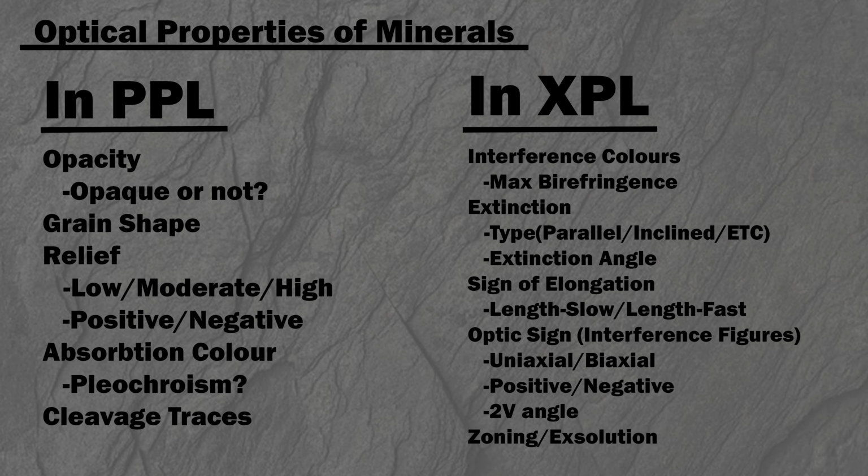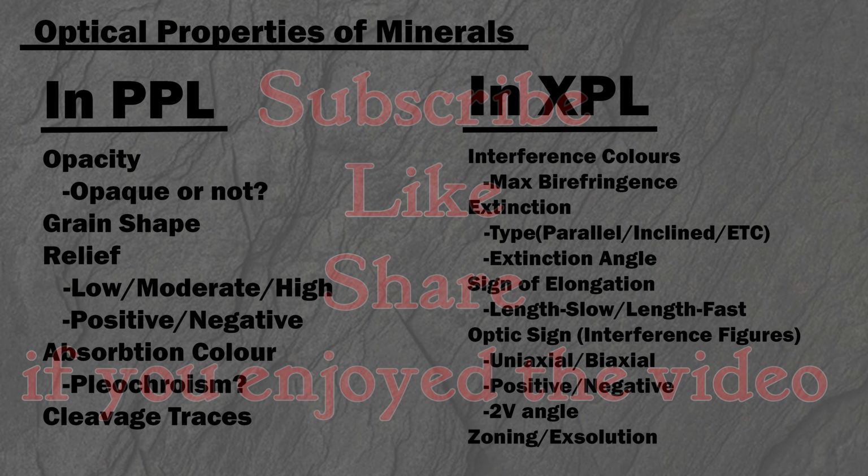And those are all the main optical properties of minerals observed under transmitted light with the petrographic microscope. Minerals such as opaque oxides or sulfides, which don't transmit light, and small clay minerals, which are too small to identify with the petrographic microscope, require different techniques to analyze.